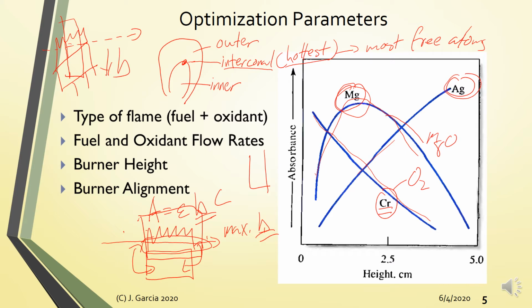This technique is useful if your samples are quite concentrated with the analyte. Instead of diluting your sample, you can reduce the cell path length by simply tilting the burner head. For most AAS systems, you can also replace the burner head. You can choose a smaller burner head or a larger burner head, depending on the requirements of your analysis or your sample.